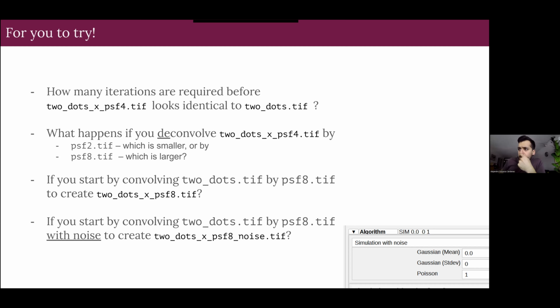I visualized it just with the Poissonian, but if you use anything else, it will look worse than what I will show you. Okay, I'll continue in 30 seconds. So it doesn't matter if you don't finish any of them.